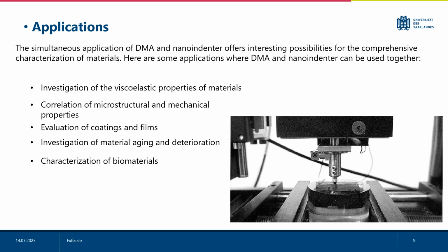For example, polymer coatings like that found on solar panels and medical devices need to be studied by DMA nanoindentation to understand this transition between viscous and elastic properties. The behavior of polymers is greatly affected by time and temperature, which can greatly affect the long-term longevity of the device if the properties are not well understood. These results will be used to better understand the life cycle of the polymer coating, among others.